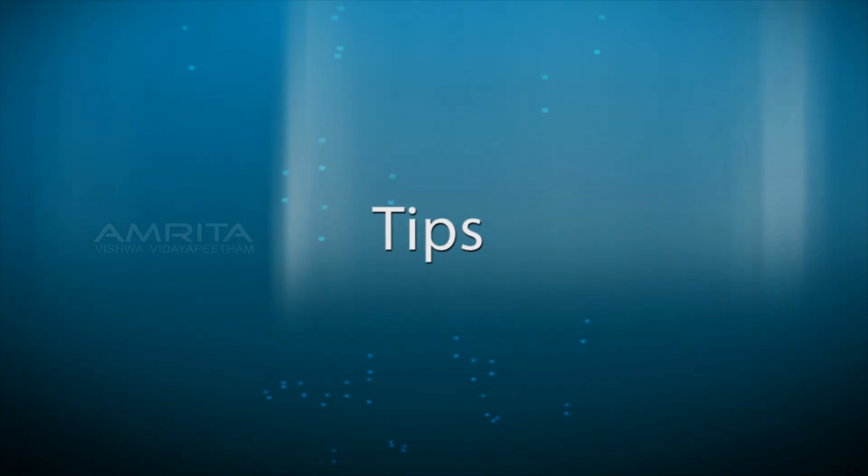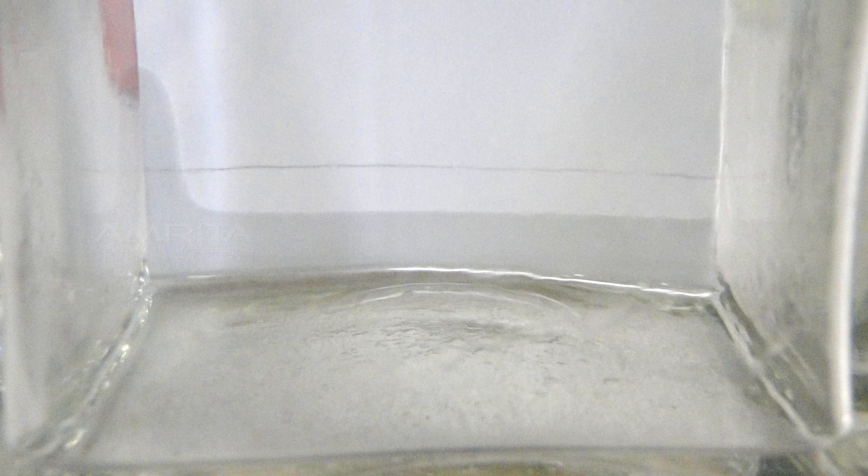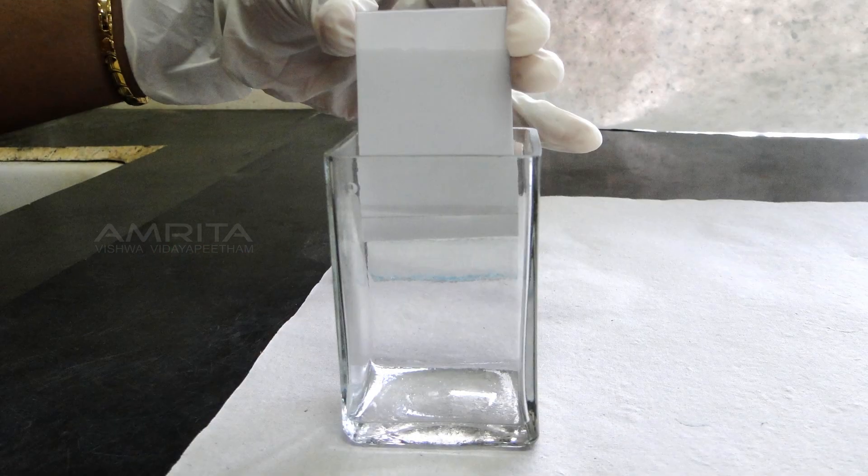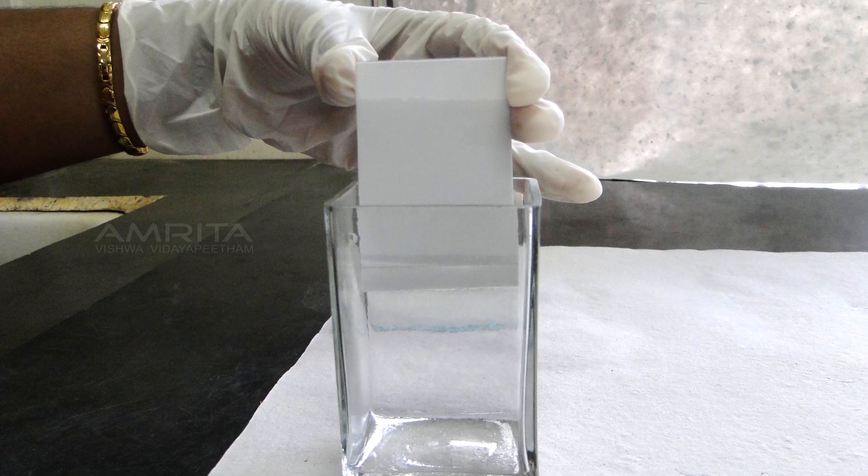Some tips for a successful result: Make certain that the spots applied to the plate are above the surface of the eluting solvent. Hold the plates by their sides. The solvent front must not advance up to or beyond the edges of the plates.